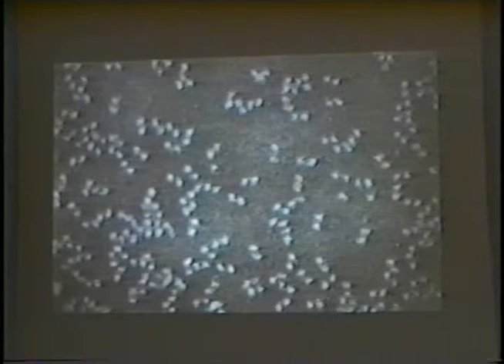Randomly dispersed in this pool of sodium phosphotungstate. In this case, by the single droplet technique. When spread on mica by the negative staining carbon film technique, alpha-mannosidase tends to form tube-like arrays. In this case, in the absence of polyethylene glycol, but when polyethylene glycol is included, the tube-like arrays tend to form parallel bundles. Unfortunately, arrays of this sort are not really suitable for doing digital image analysis.